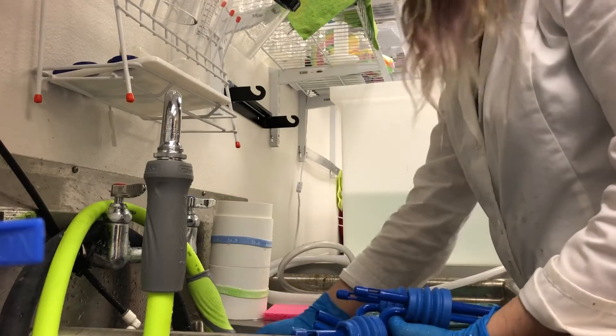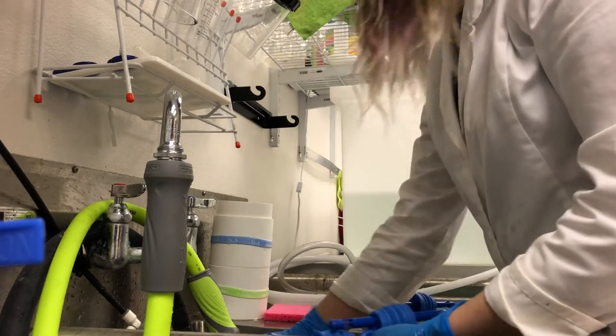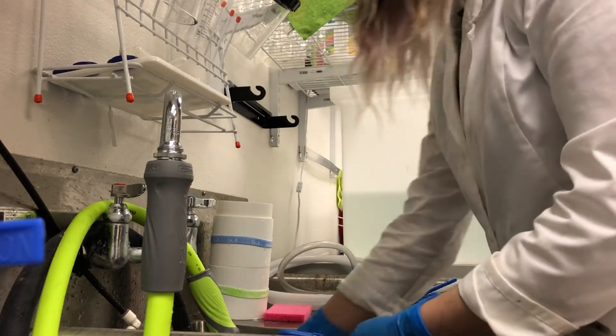We will do one final rinse in tap water and place the dishes onto a drying rack to dry. If the dishes need to be used immediately then they need to be rinsed with RO water to make sure that there is no chlorine left on the dishes from the tap water.